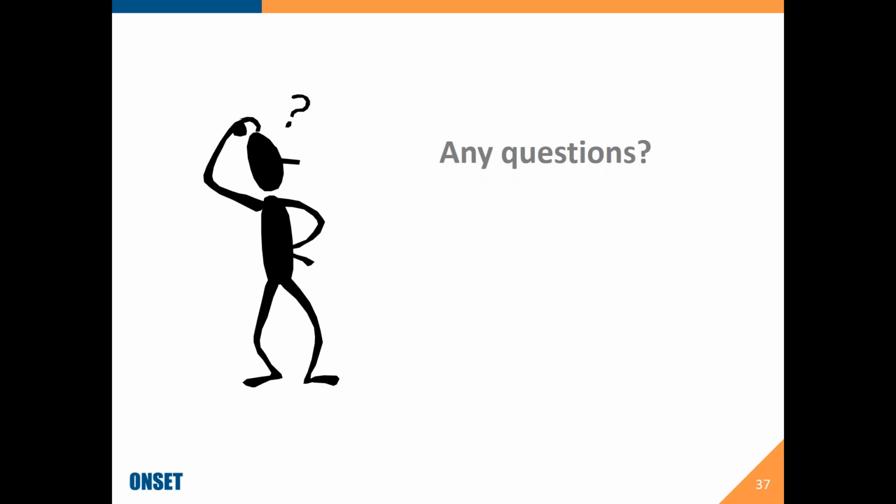There were a couple of questions earlier that I received in the portal between slides, so I'm not 100% sure which model was being referred to, but there was a question about the depth, and I think that was related to the slide about the water temperature data loggers when Shannon was talking about the tidbit, which is coated in epoxy and therefore is able to withstand higher pressures at a deeper depth.